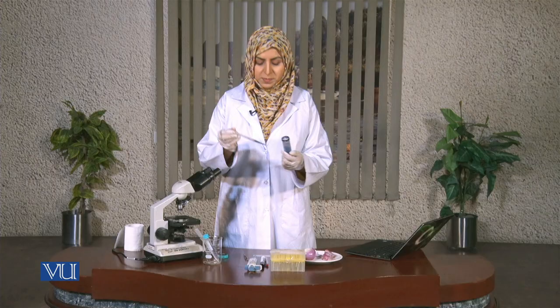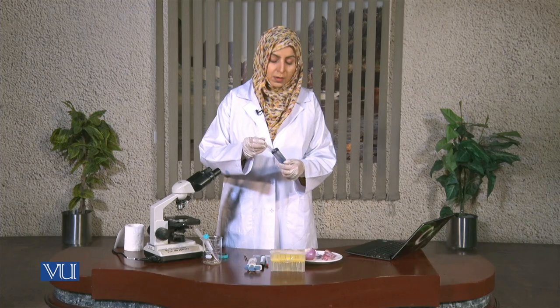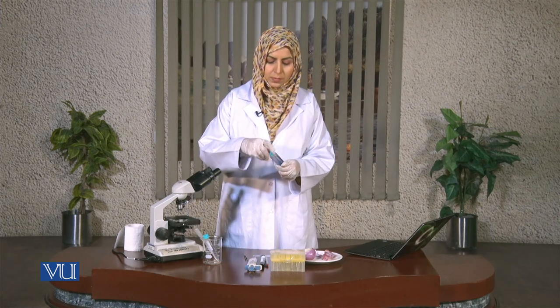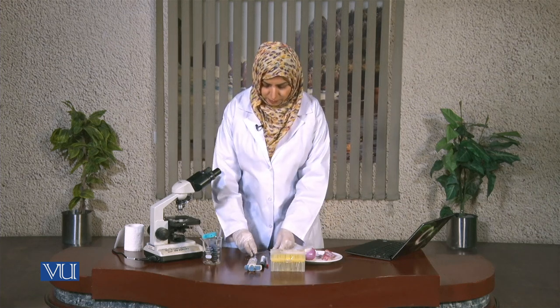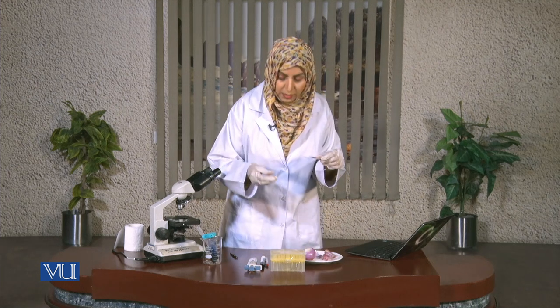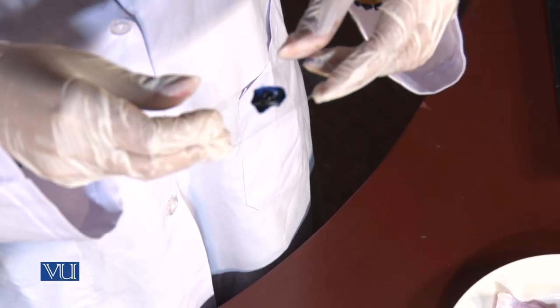We will add one or two drops of stain to it. Now let it stay for one or two minutes. Now we can see that it is stained, and we can now put the cover slip over it. While putting the cover slip you have to be very careful because we do not need any bubbles and we do not need to wrinkle our onion epidermis.